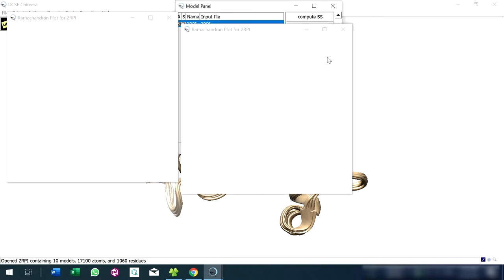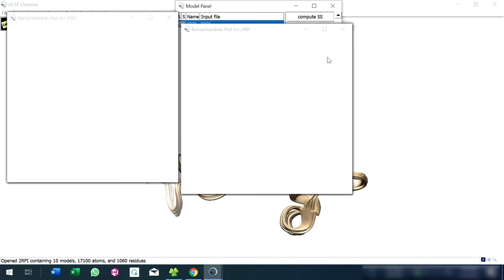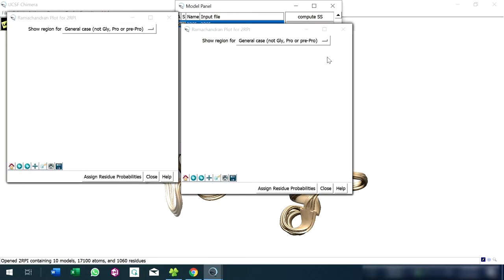Now the image will be displayed. This is the Ramachandran plot for the selected protein.